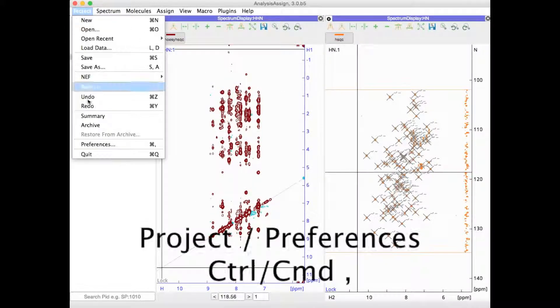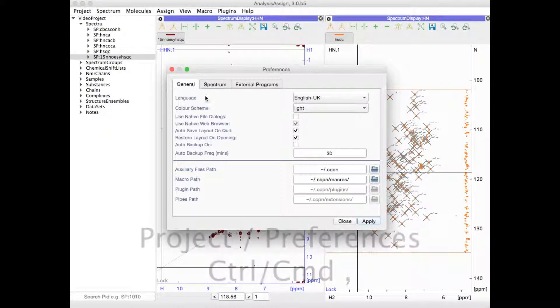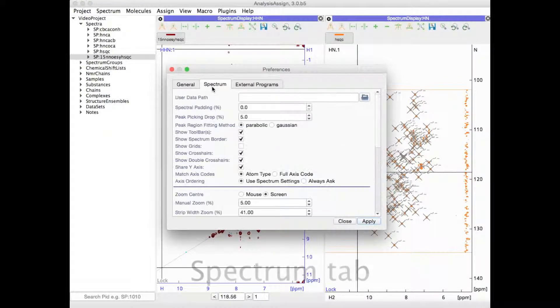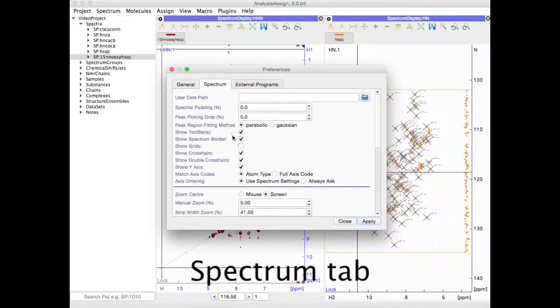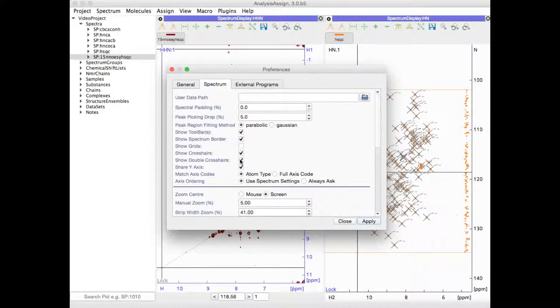If you go to Project Preferences, then under Spectrum, you can also set what you would like your global preferences to be, i.e. what the default value is when you open or create a new project.